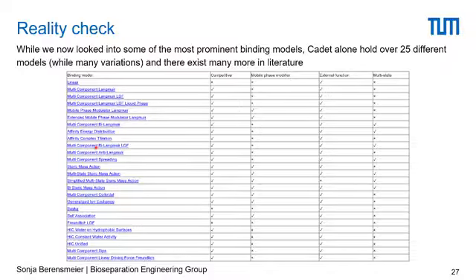Okay, we have now looked at different adsorption models, three in total. However, this is just the beginning, right? There are many, many more adsorption models. CADET, the software we are using for chromatography modeling, alone has over 25 different models included, and there are many, many more in the literature. There are different adsorption models for hydrophobic interaction chromatography. We have models for size exclusion chromatography. We have models for affinity chromatography. As you can see, the list goes on. Multi-component adsorption models, just to give you a general idea that there is really no limit to what you can do in an adsorption model.